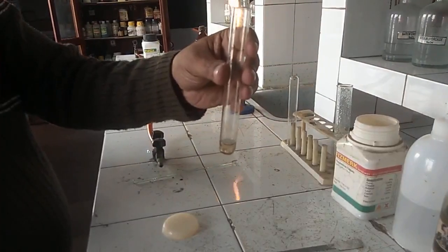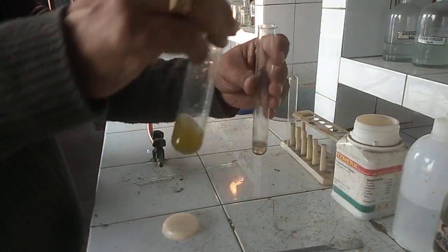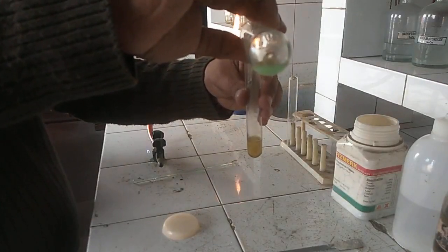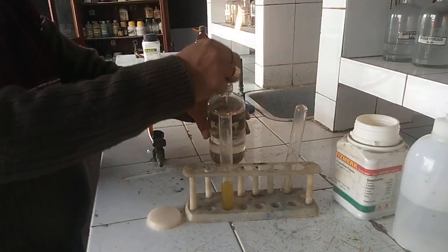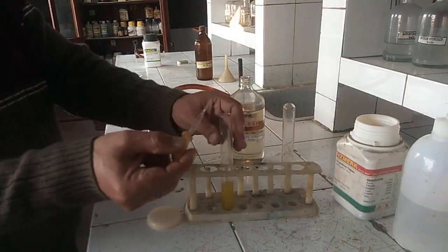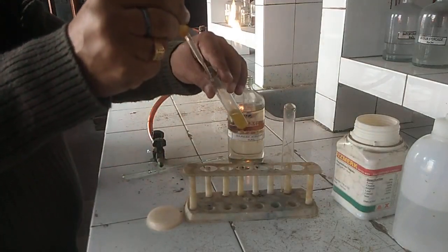Now we will add a saturated solution of freshly prepared ferrous sulfate to this. Now very slowly, with the help of a dropper along the wall of the test tube, we will add concentrated H2SO4 to this.